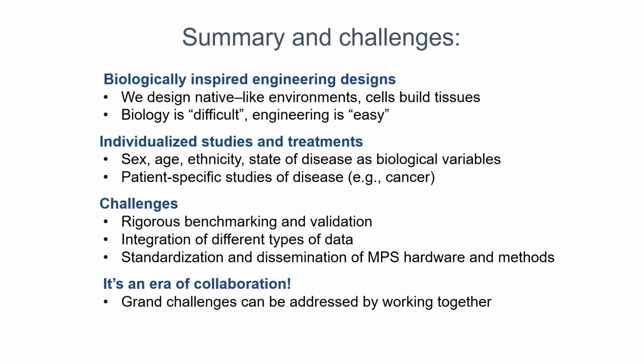As we generate more and more data, integration and interpretation of these large volumes of data of different kinds becomes another challenge. And there are methodologies based on different approaches, including machine learning, that are here to help us.